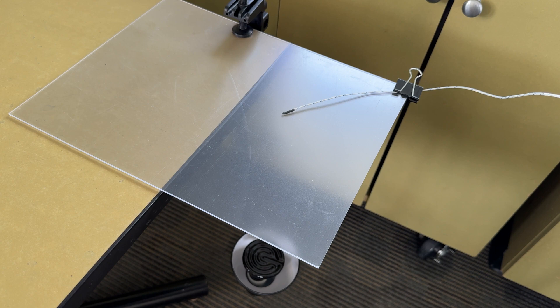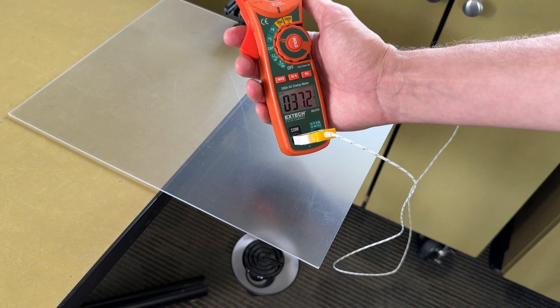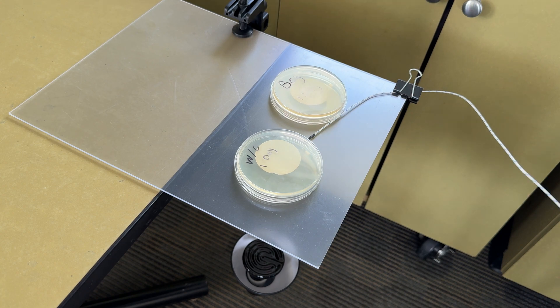Because I don't have an incubator, I needed to come up with something to keep these samples at about 37 degrees Celsius for a couple of days — 37°C being the ideal temperature for culturing bacteria. What I came up with was an upside-down lamp with a ceramic bulb fixture underneath a polycarbonate plate. By adjusting the distance from the polycarbonate plate I was able to get just about 37 degrees on the dot. I'll place the samples upside down on there and let them sit for a couple of days, checking back in about 72 hours to see if they're growing anything.